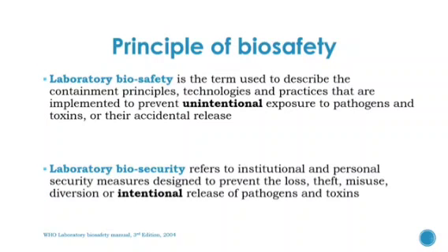The principle of biosafety. Laboratory biosafety is the term used to describe the containment principles, technologies, and practices that are implemented to prevent unintentional exposure to pathogens and toxins or their accidental release. This must be differentiated from biosecurity, which refers to institutional and personal security measures designed to prevent the loss, theft, misuse, diversion, or intentional release of pathogens and toxins.